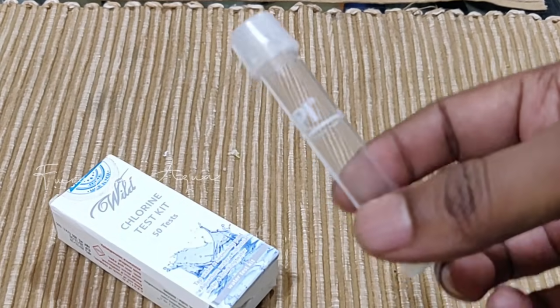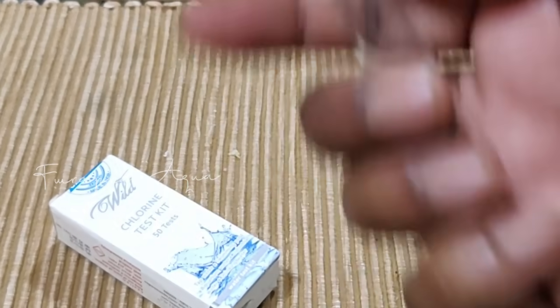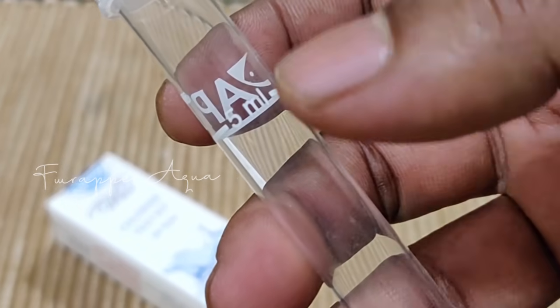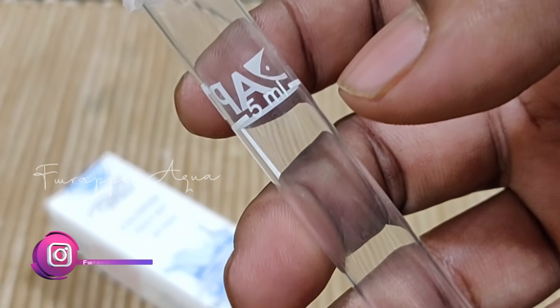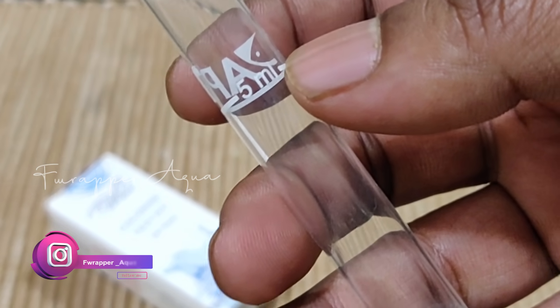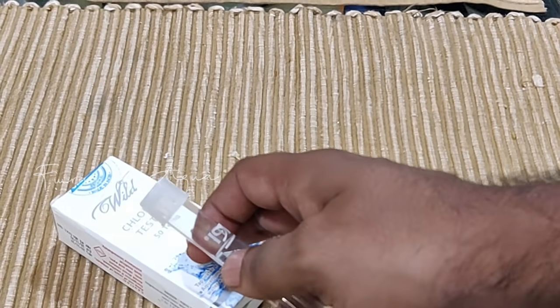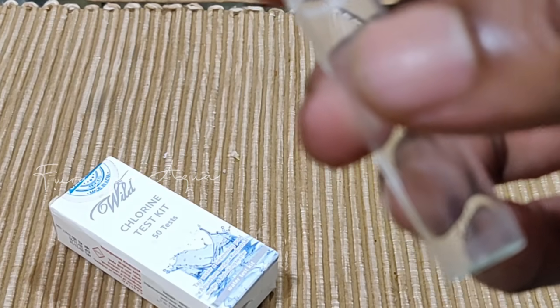I also have an API fresh water test kit, which includes a test tube that holds 5ml of water. To test chlorine, you need to fill 5ml of the water you want to test and then add drops from the bottle. So let me take some water from the tap and check how much chlorine is in the tap water.